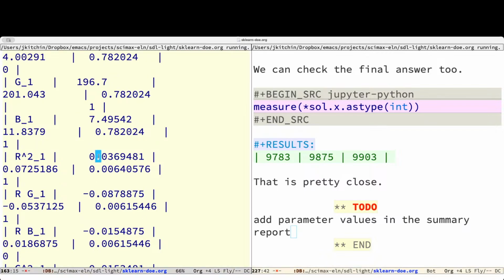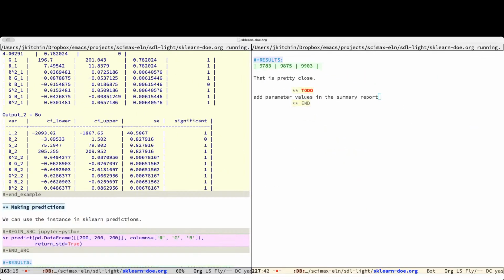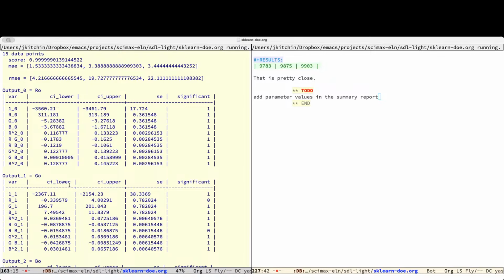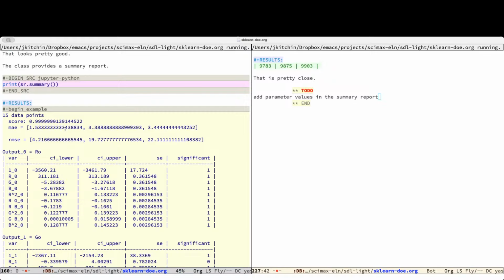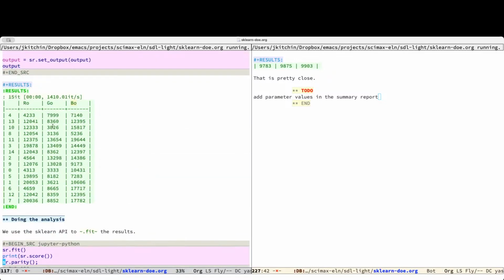It doesn't seem like the most important thing that we need, because we'll never use these for anything other than looking at them. But I suppose sometime in the future, somebody might actually take this text and use it instead of using the actual digital versions. Let's see, was there another thing?